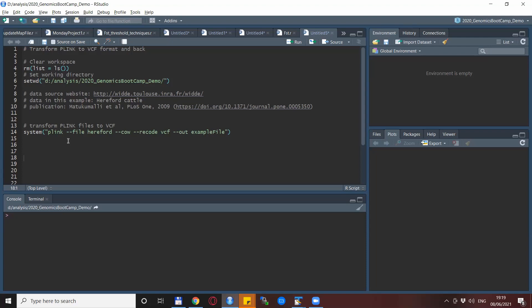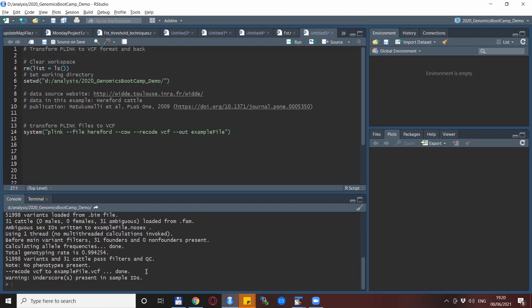From Plink to VCF it is quite straightforward. You use any data you want already in Plink format and you use a dash-dash recode statement with a VCF modifier. After we run this we get the VCF file with the name that we specify in the dash-dash out statement.